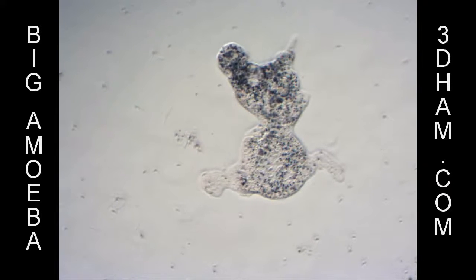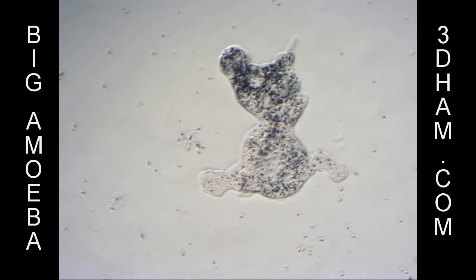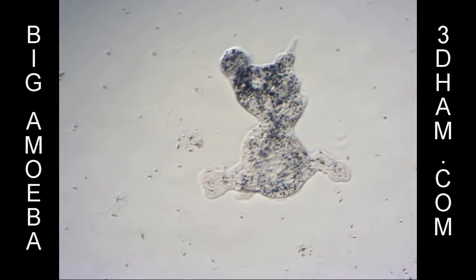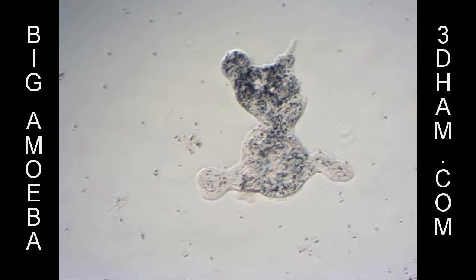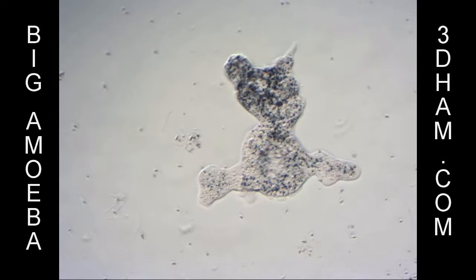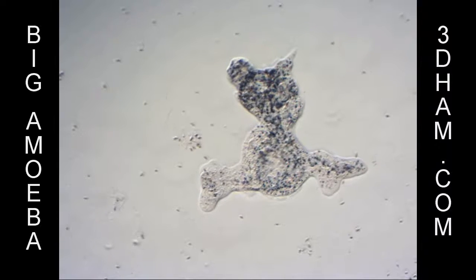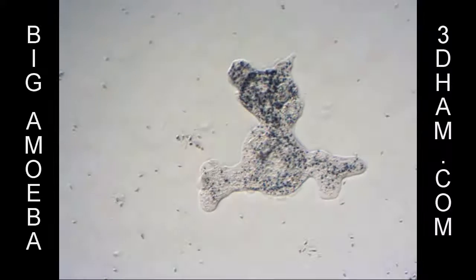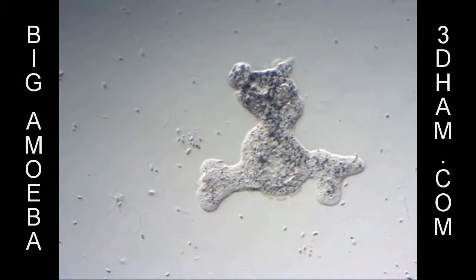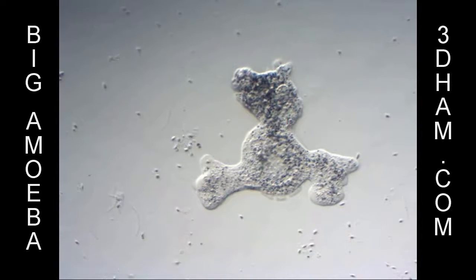This is a really large amoeba shown at 250 power under oblique lighting. Oblique lighting is at an angle instead of being directly underneath. This gives differences in shading at different depths, thus eliminating the flatness usually associated with substage lighting and emphasizing the three-dimensional nature of the subject. Though this video is composed of 5 different segments, the same amoeba is shown throughout.